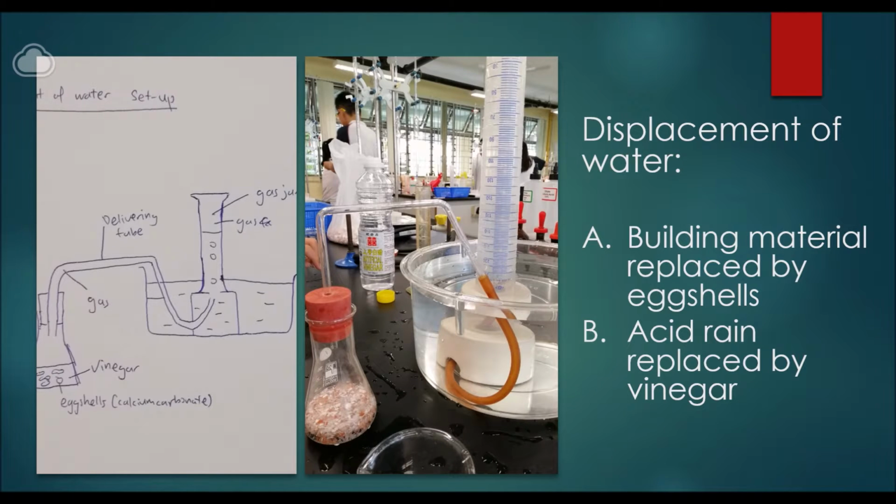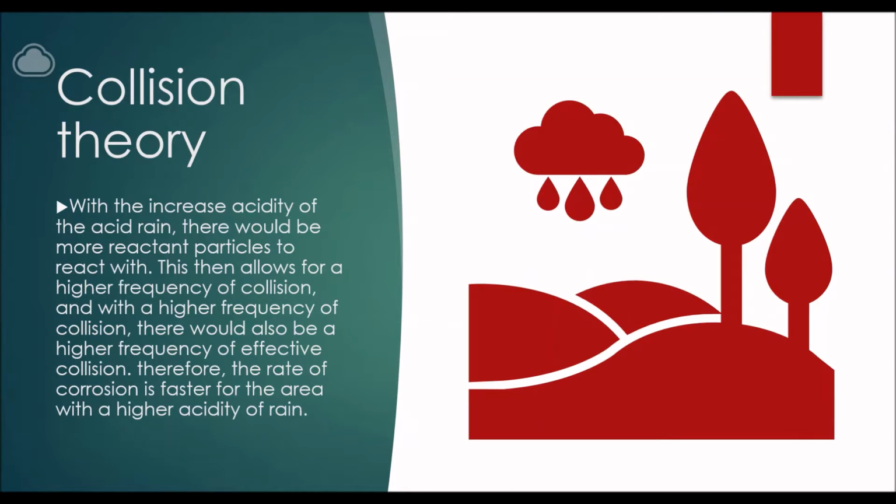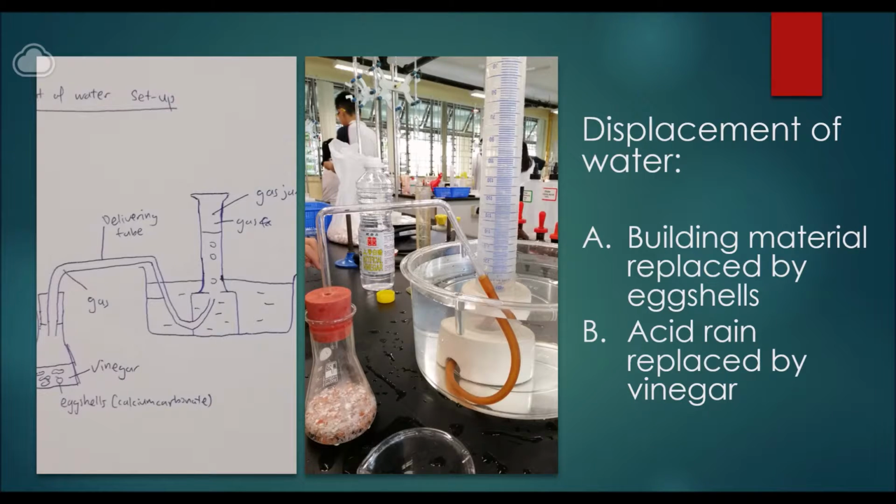Through my pre-calculations, I found out that 5.5 grams is the average weight of an eggshell, and 95% of it is CaCO3. So with this knowledge, we discovered that 30 ml of vinegar would perfectly submerge all of the crushed eggshells. Due to time constraints, we were only able to use 5 minutes for each experiment, and in each minute we recorded the amount of CO2 made.